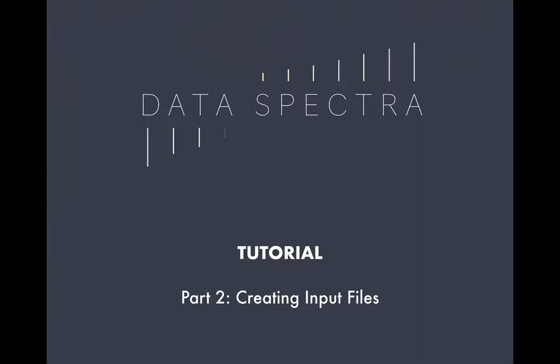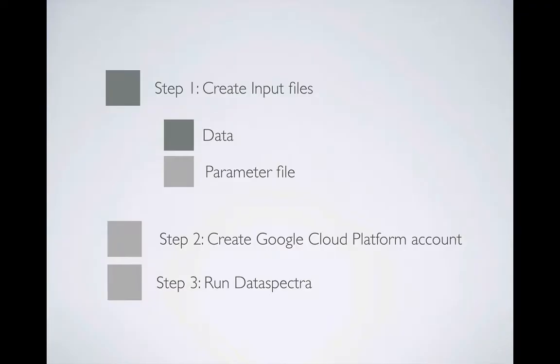Here I will walk through how to create the input files for Dataspectra. There are two types of input files for Dataspectra. First is the actual data. The data for this tutorial is downloaded from the BrainSpan resource. For more information about that resource, please see the first video.